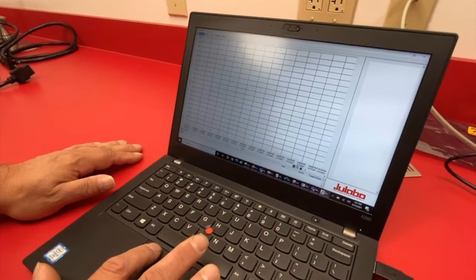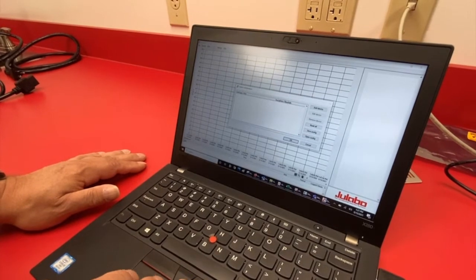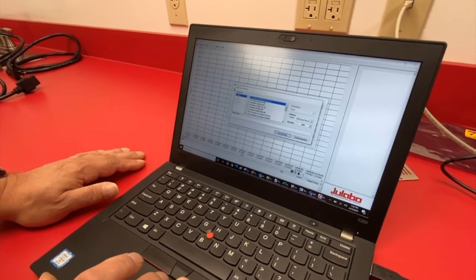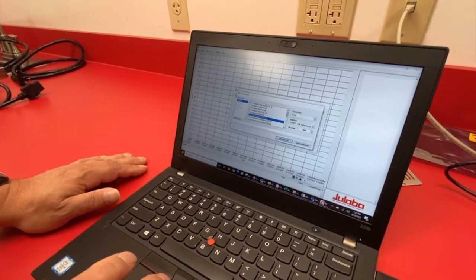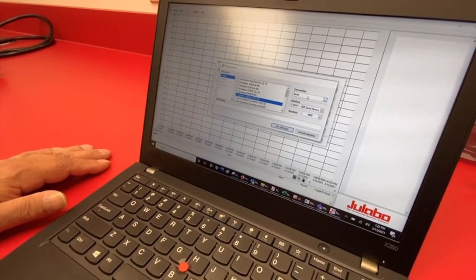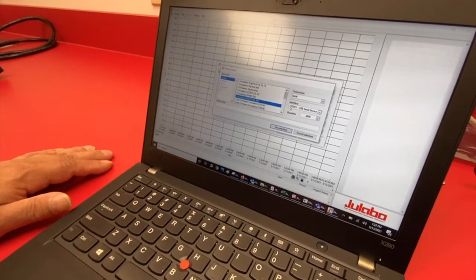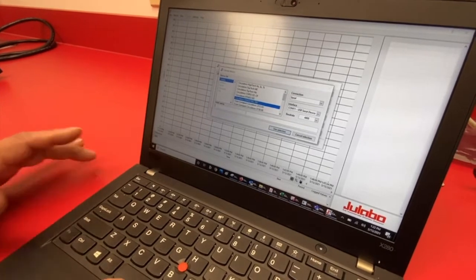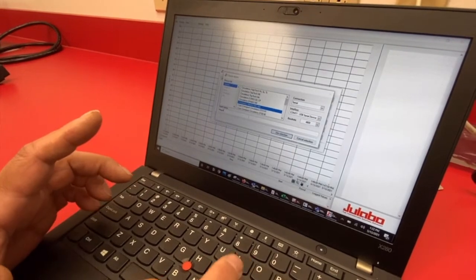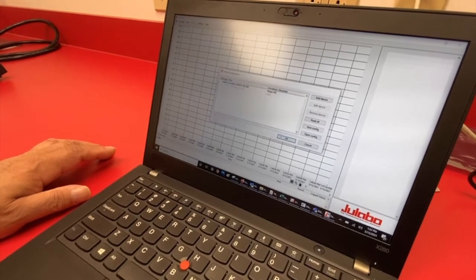So first we're going to set up the device in EasyTEMP. So you go to the Devices, Config Devices, Add Device, and you'll notice in the drop-down menu you have circulators MAGIO, MS, MX. Currently I have the USB connection connected. It shows up as a serial connection with a COM11. You would want to name your device. Then click Use Selection.